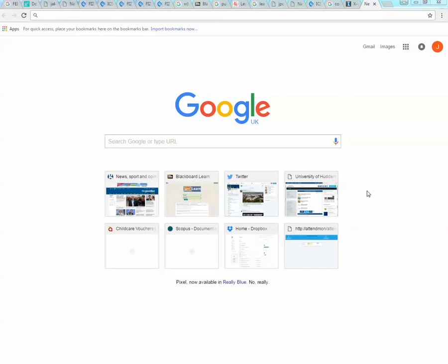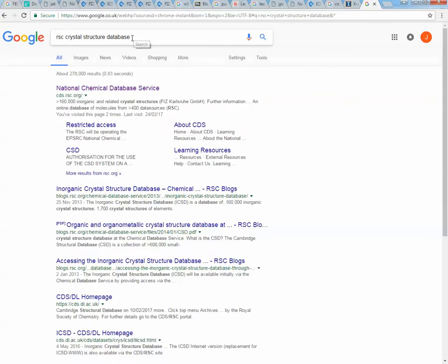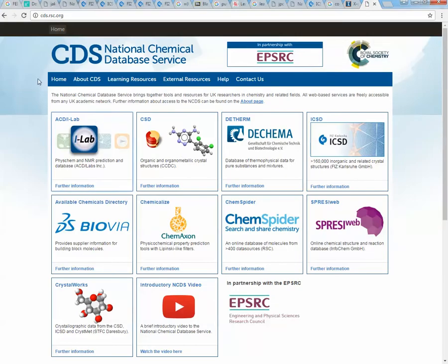This video is going to show you how you can get some information about the X-ray diffraction patterns of crystal structures, and it'll also give you other bits of information about those crystals or those minerals. So first of all, if I Google RSC and crystal structure database, you get to something called the National Chemical Database Service. Click that one and you end up with this box.